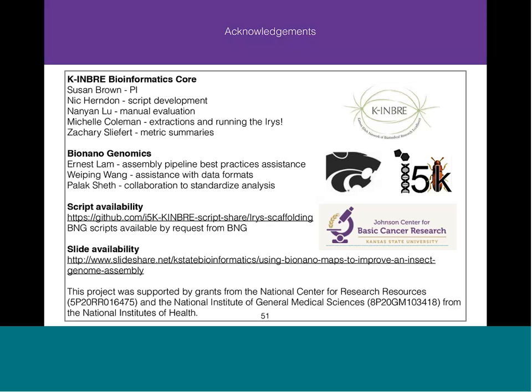So we're saying here's an independent line of evidence. Where do they agree? Where do they disagree? How can we use that to rearrange, reorder, identify misassemblies, and super scaffold these two genomes? So it's really more about an independent line of evidence to improve the quality of the genome rather than to label a particular area as a centromeric repeat or.